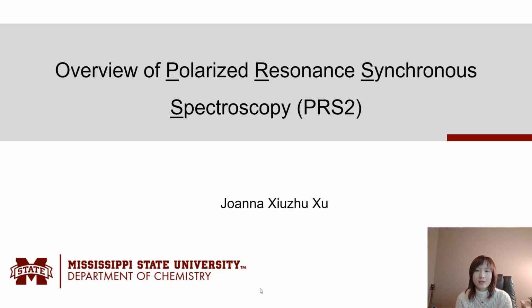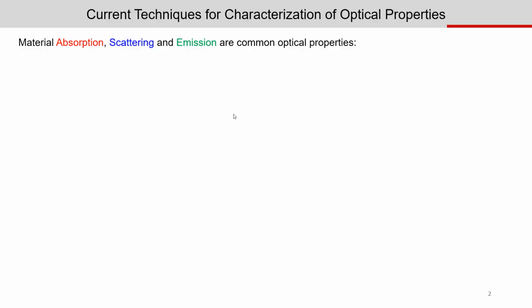I'm a graduate student in Dr. Dongmao Zhang's group. In this video, I would like to give you an overview of the Polarized Resonance Synchronous Spectroscopy, PRS2, which is developed in our group. First, let me give you some background.